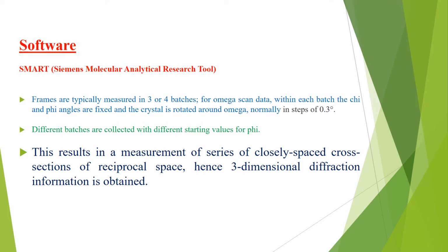This is known as SMART, Siemens Molecular Analytical Research Tools. The SMART software controls the operation of the diffractometer.